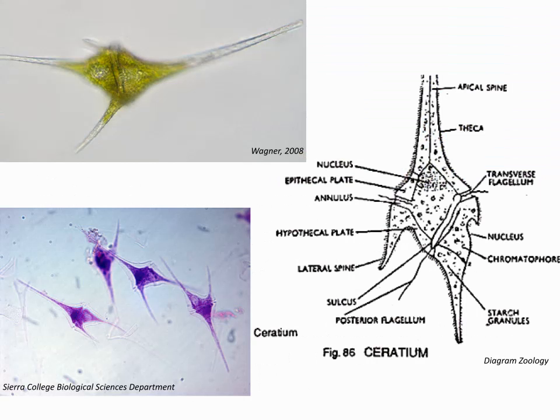Finally, let's see a few samples of dinoflagellate species as they would look under the microscope. Here we see 2 slides of the species Ceratium hirundinella with noticeable armor plates. It has a 3-pointed structure. Under a standard light microscope, it can be very difficult to see the flagellum, especially if it is not live or moving, as this is transparent.